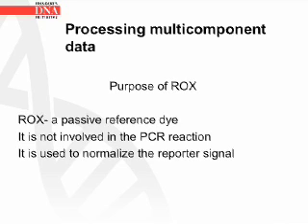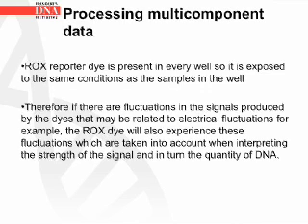What is the purpose of the ROX dye? The ROX is a passive reference dye. It is not involved in the PCR reaction. It is used to normalize the reporter signal. So how is ROX used to normalize the reporter signal?